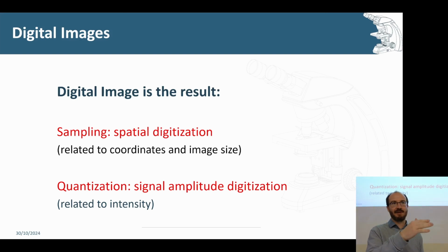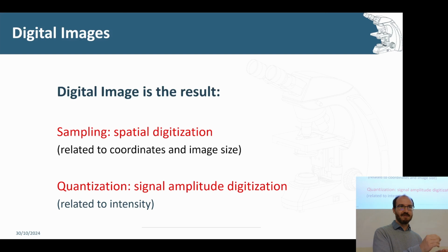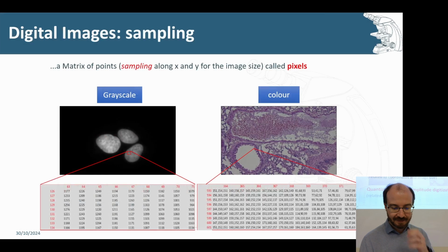So if you have a bit depth of 8, I'll talk more about it just now, then you only have 256 discrete intensities that you can capture. If you've got 16-bit, much more, but often if you've got like 12-bit, then it's like 4096 or something like that. I can't remember exactly. But the point is that the quantization determines how much nuance, how much dynamic range you can actually see within your image, and that's sometimes important, especially if you want to segment things out. You need to know what is now one structure and what is another structure, and you need that intensity variation.